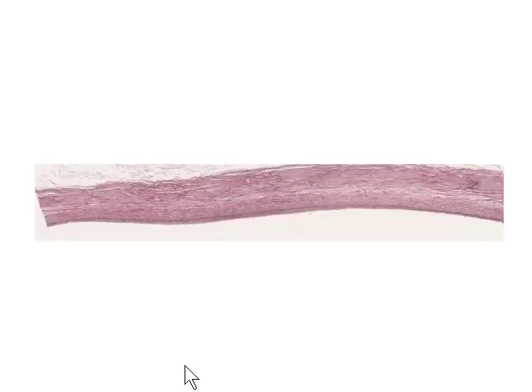Here we're going to take a look at the largest vein in the body and the wall structure of the largest vein in the body, and this is the inferior vena cava. And what we're going to look at is the tunica intima. We can just make out maybe where the intima is here, the tunica media, and then the adventitia. And as before, at low magnification, there's very little detail we can make out.